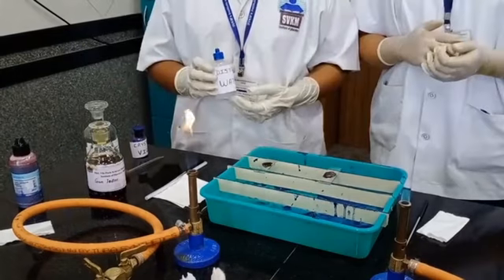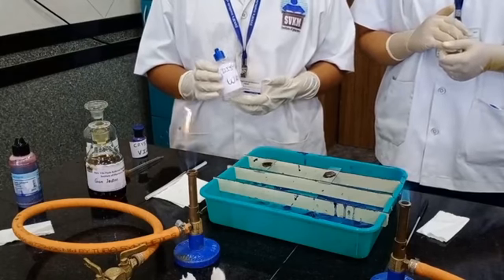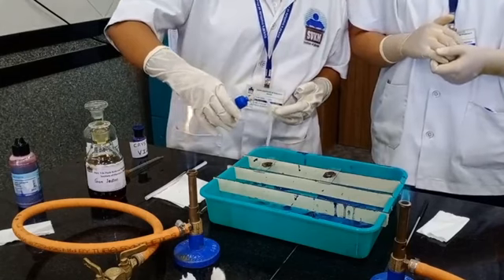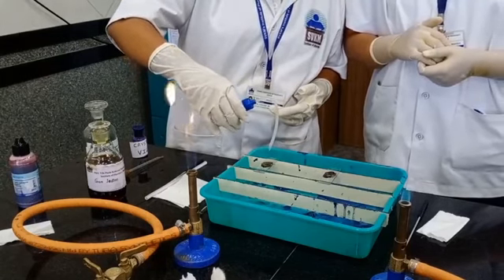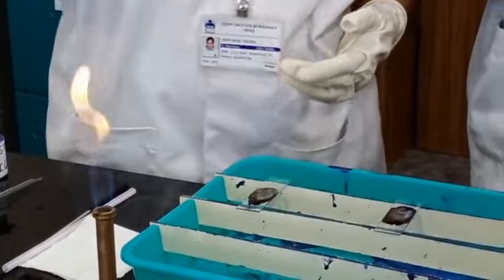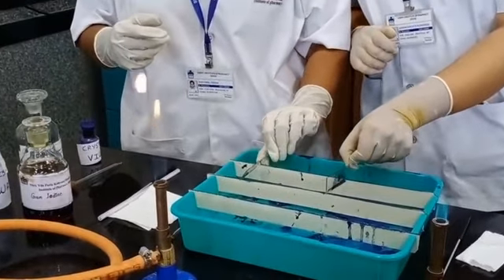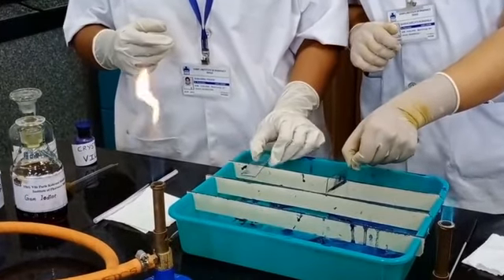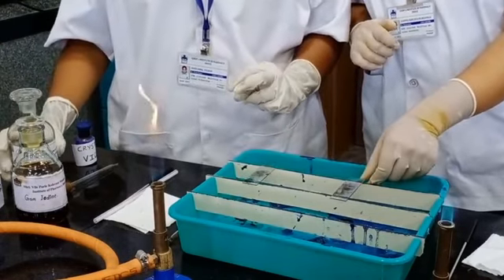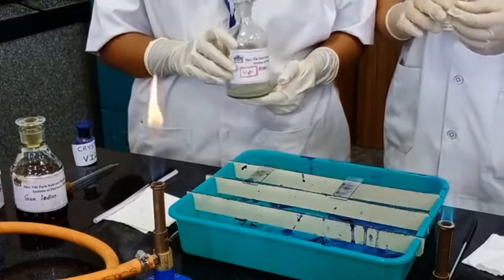After adding Gram's iodine, now we will wash the slide with distilled water after waiting 2 minutes. The required amount of water has been added and the water is drained off. Now after waiting for a sufficient amount of time, we will add the decolorizer, which may be alcohol or acetone.